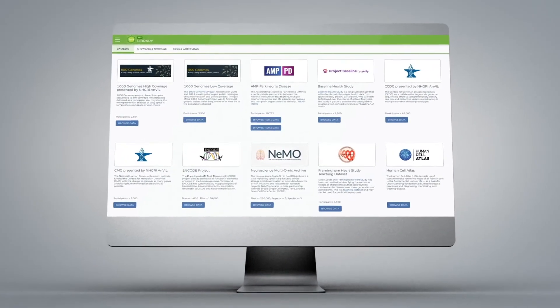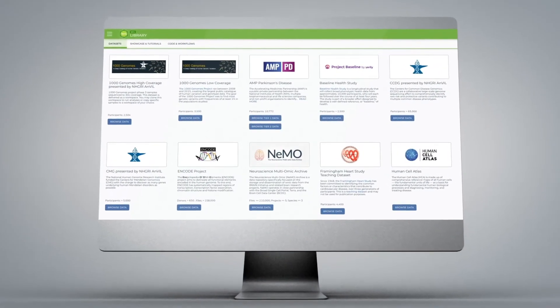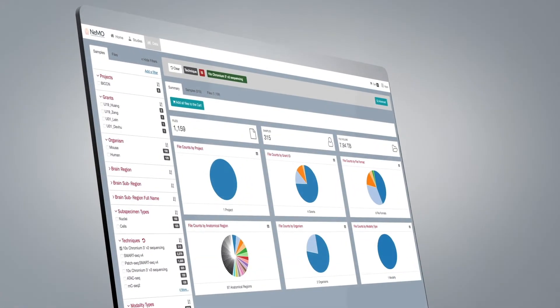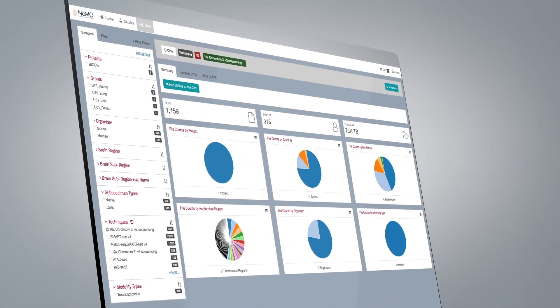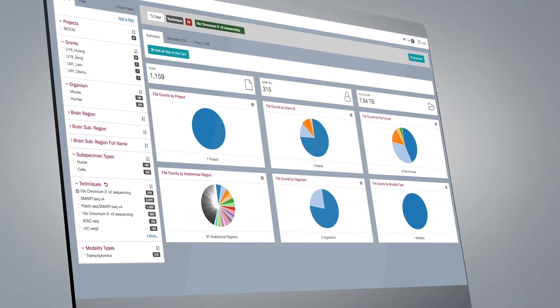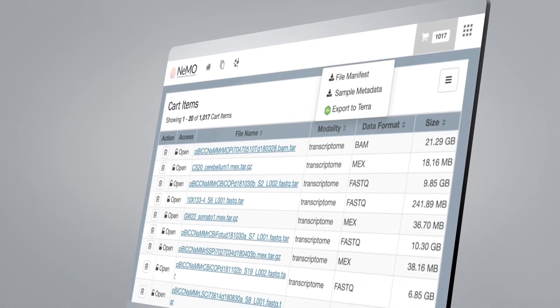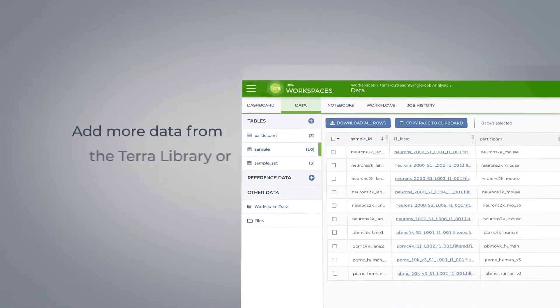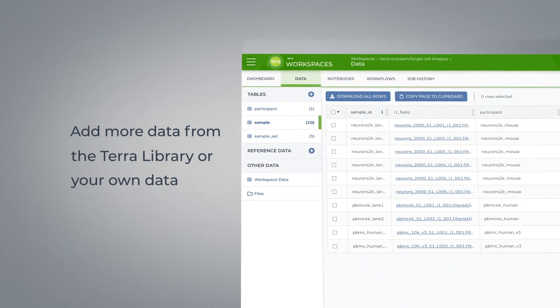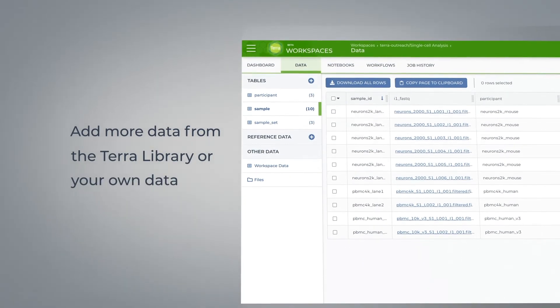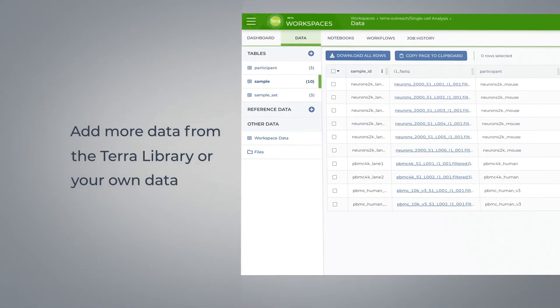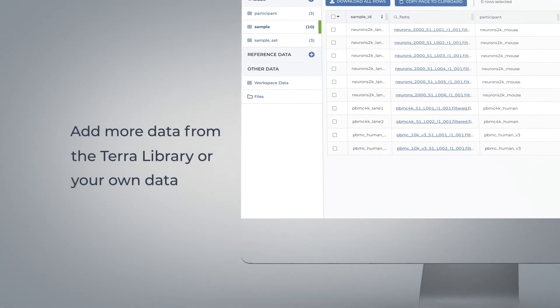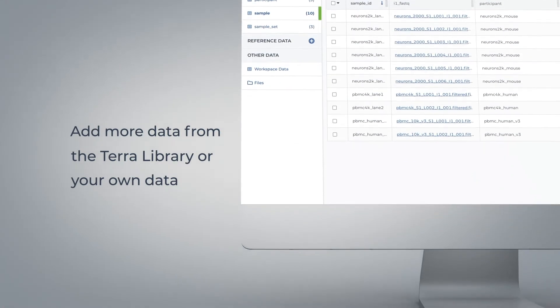Through Terra, you can explore a wealth of open and access-controlled data sets hosted on the cloud. You'll be able to select data of interest and import it into your Terra workspace with just a few clicks. In your workspace, you can combine the imported data with other data from the library or with your own data, and apply cross-dataset analyses to generate novel insights.